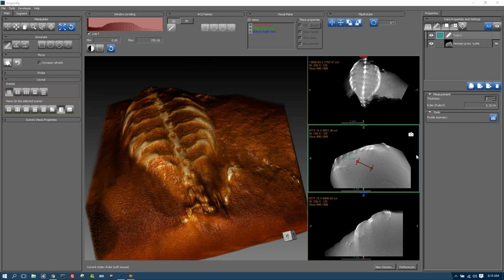I would suggest you do that, because that was essentially the question I was asking before about the rulers, as to whether you could fake the landmarks. Right. So we already have that in 2.1. It's just what you want to do with that next. We'd like to support the workflow rather than you having to work around it. We don't want you to use Dragonfly tools to pigeonhole them into your application. We'd like to be able to support your application in a user-friendly way.